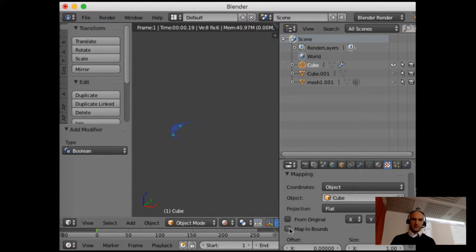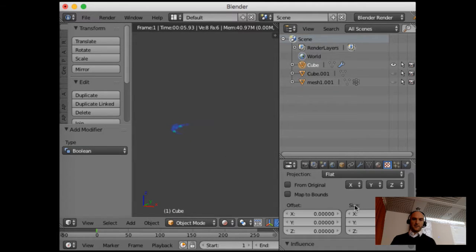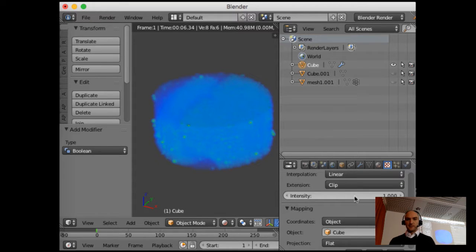If we don't do that anymore, we've obviously clipped, oh sorry, 0.5, because we've offset the cube. Anyway, I'll tell you next time why you need to type in minus 0.5. But now we've got a nice cross section.